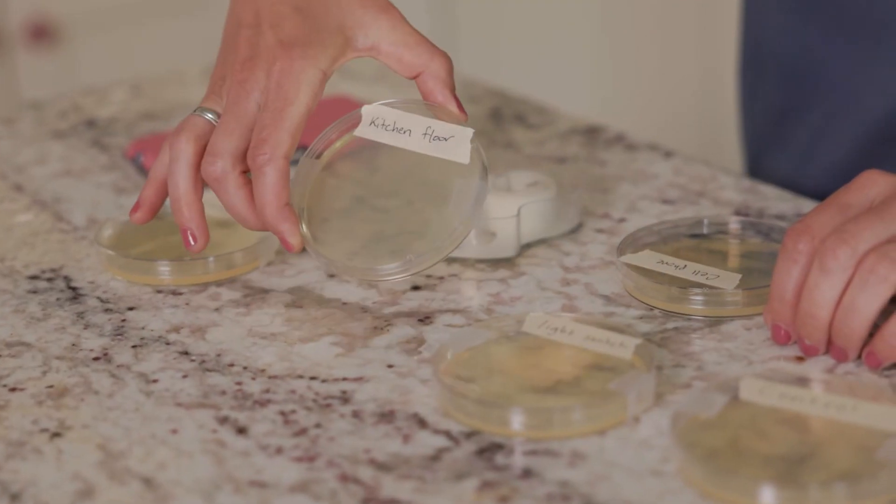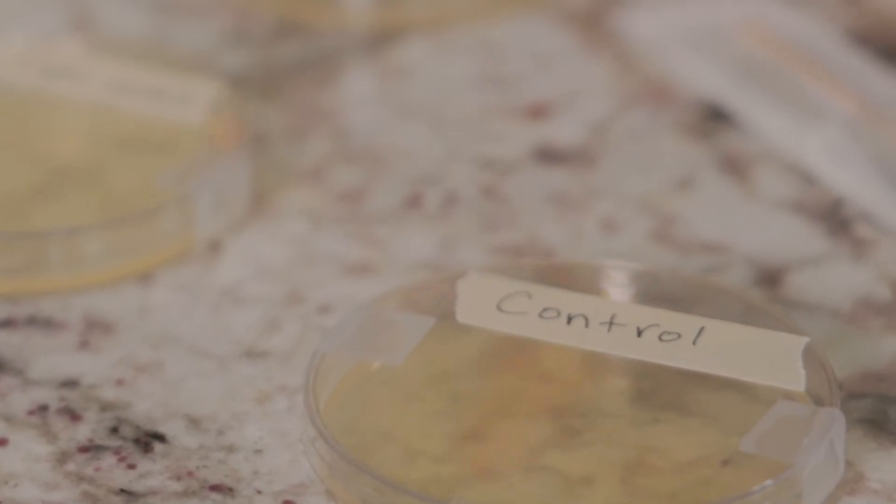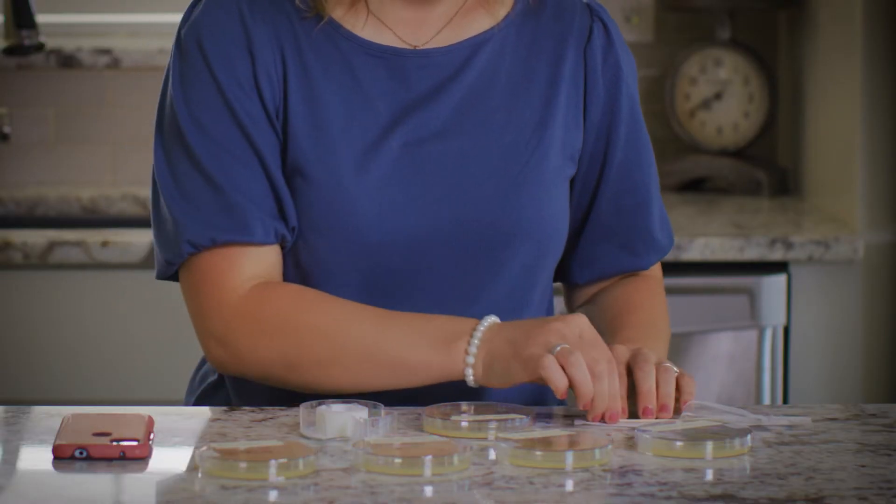You can see that I labeled each of the plates with the location, and then I labeled the fifth plate as control. Okay, we're ready to collect a sample.